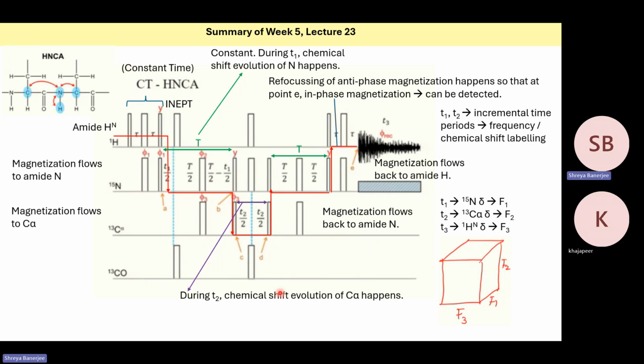So in this particular experiment, there is some role of the 13C carbonyl also, but we will not discuss that in detail because we are not going that much into the mathematics of this.